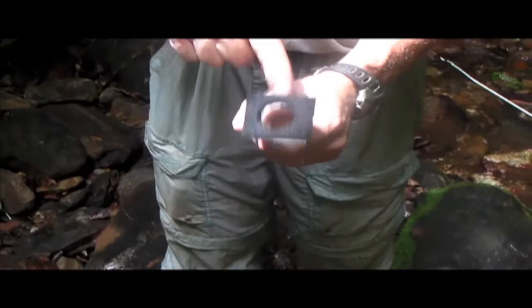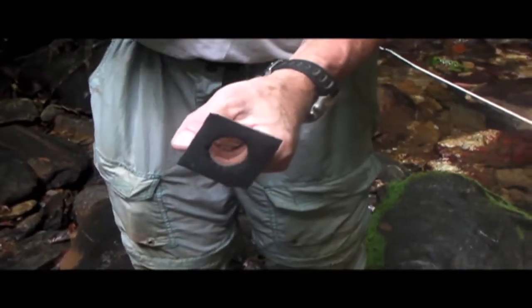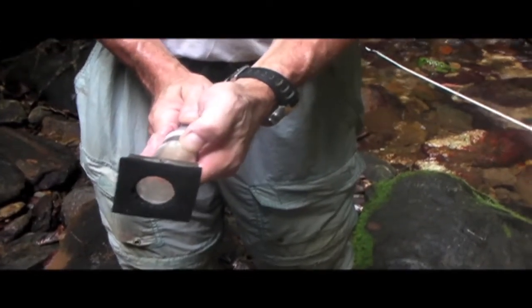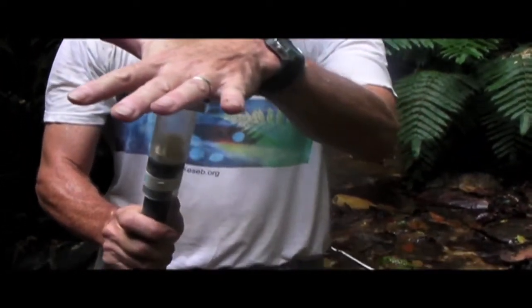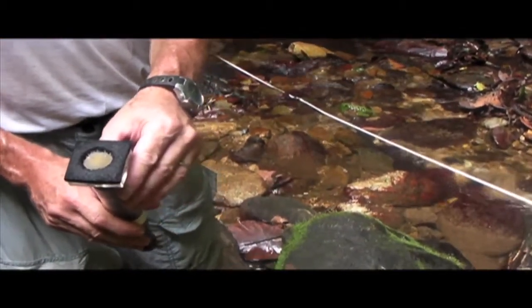And so the water runs from the hole just into this surface, which means it's going to suck up everything that was scraped off of the environmental surface, and everything that was on the environmental surface will now be in this tube. And then I put my hand over it and I save that sample. And it's what we use to get a sample of what it was that was actually on the surface of the rock that I'll be sampling. And this also represents the standard sampling area, so that the samples are fairly uniform from one to the next.